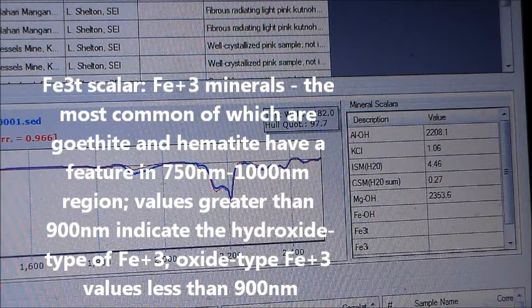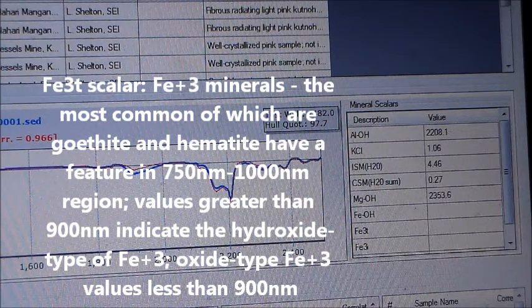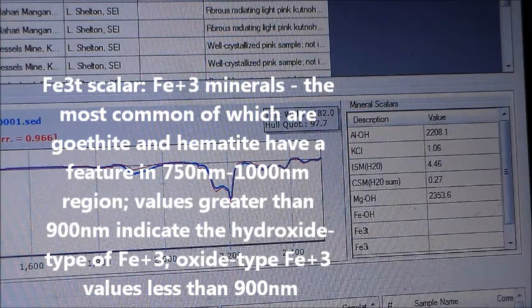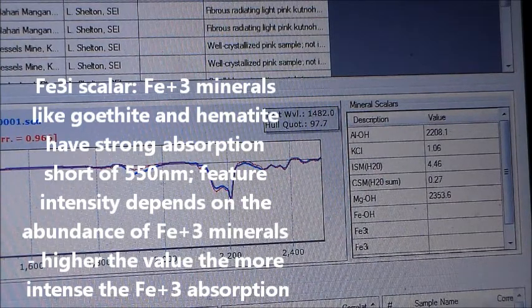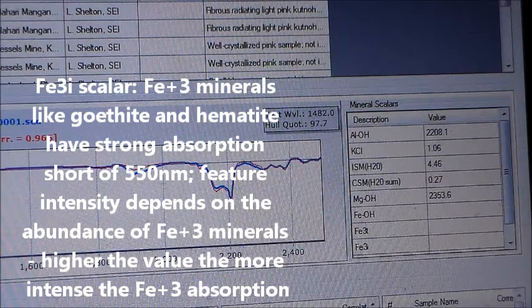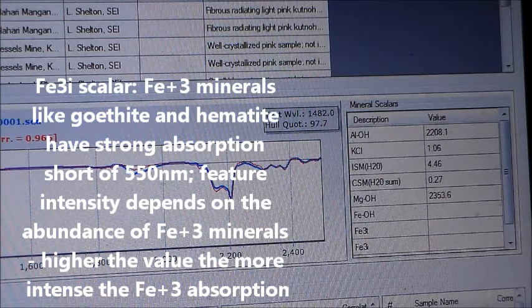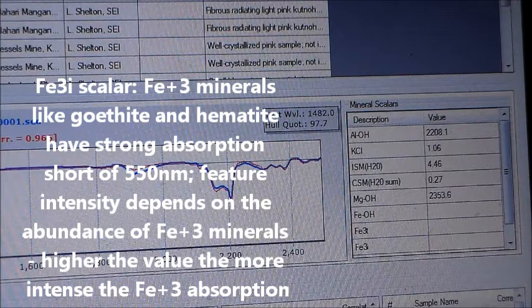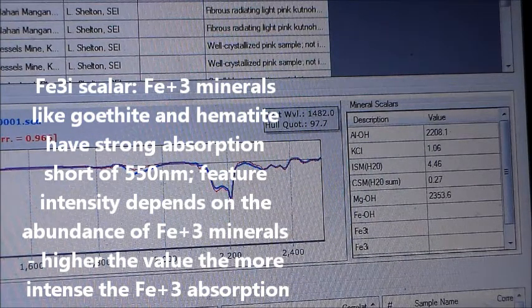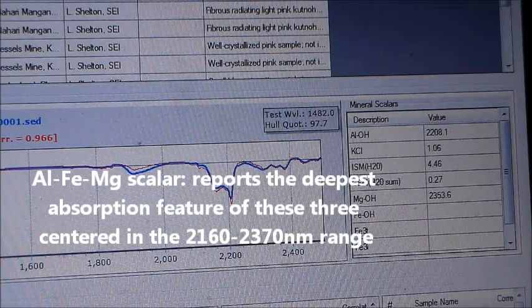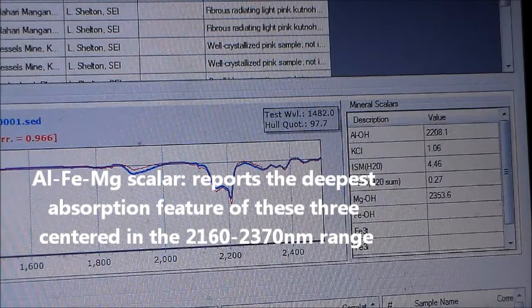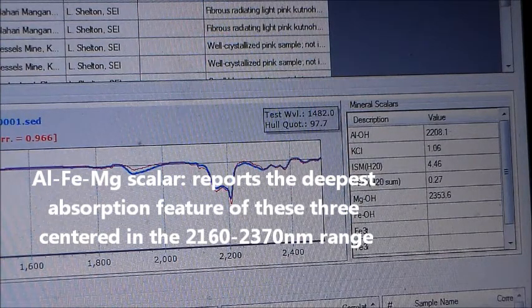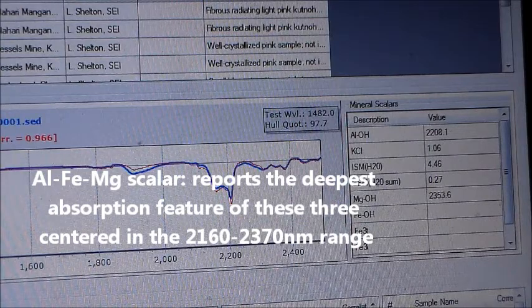A value greater than 900 nanometers indicates the hydroxide type of Fe3; a position less than 900 nanometers indicates the oxide type of Fe3. The Fe3i scaler uses the absorption feature for Fe3 minerals like goethite and hematite with a strong absorption feature below 550 nanometers — the more intense the feature in depth and broadness, the greater the abundance of Fe3 minerals. The ALFEMG scaler reports the wavelength of the deepest absorption feature of these three minerals between 2160 and 2370 nanometers and gives an indication of geochemical conditions at alteration.